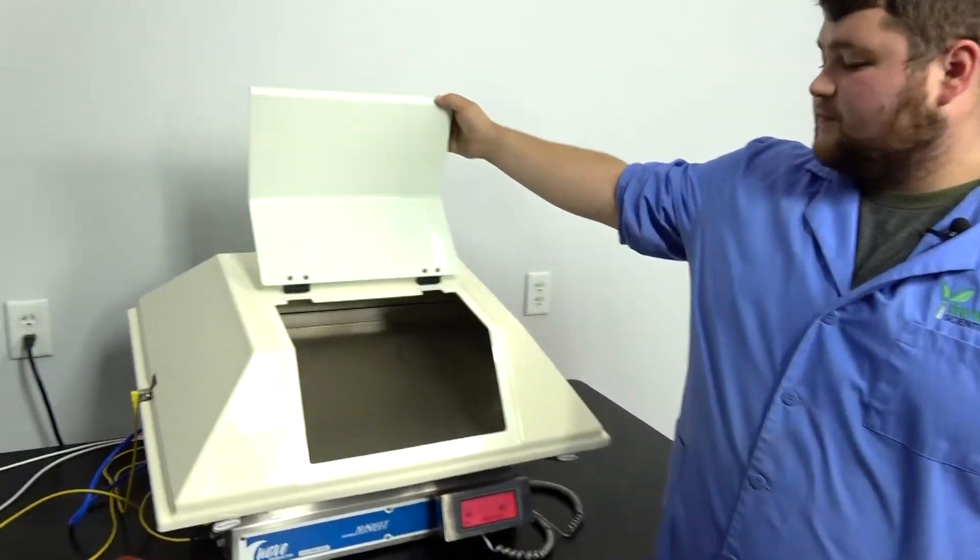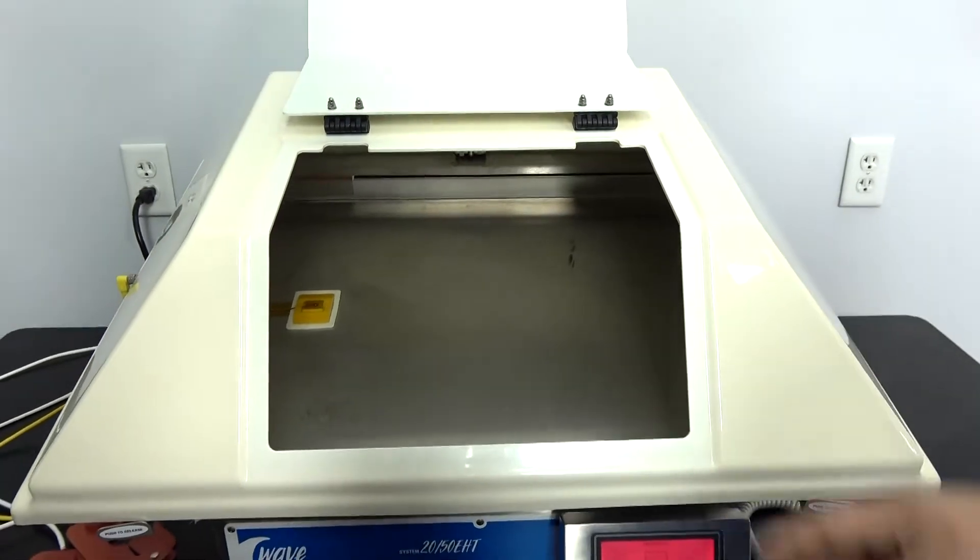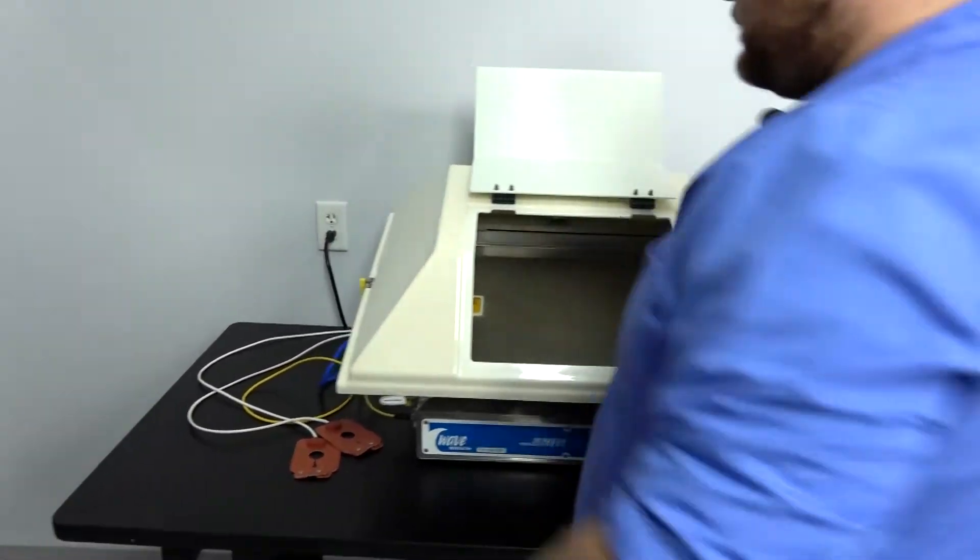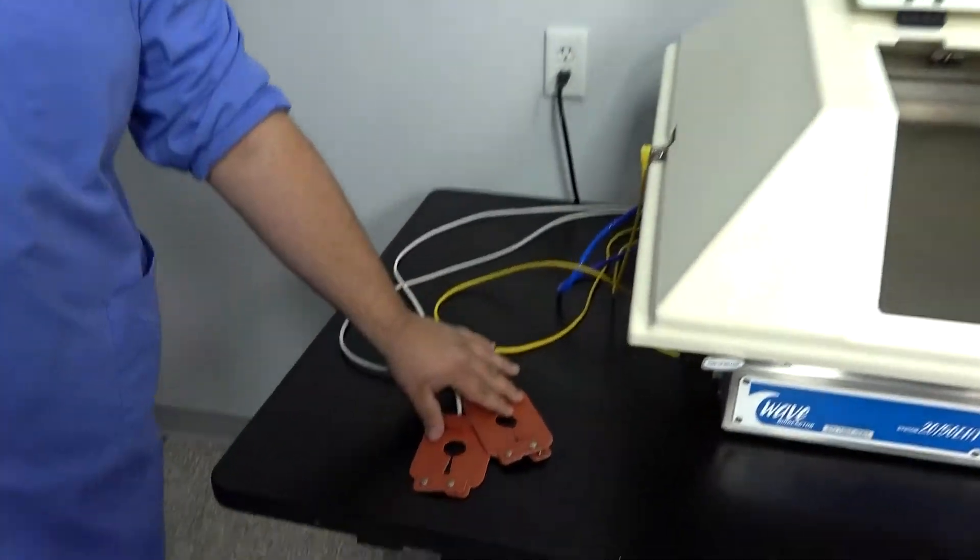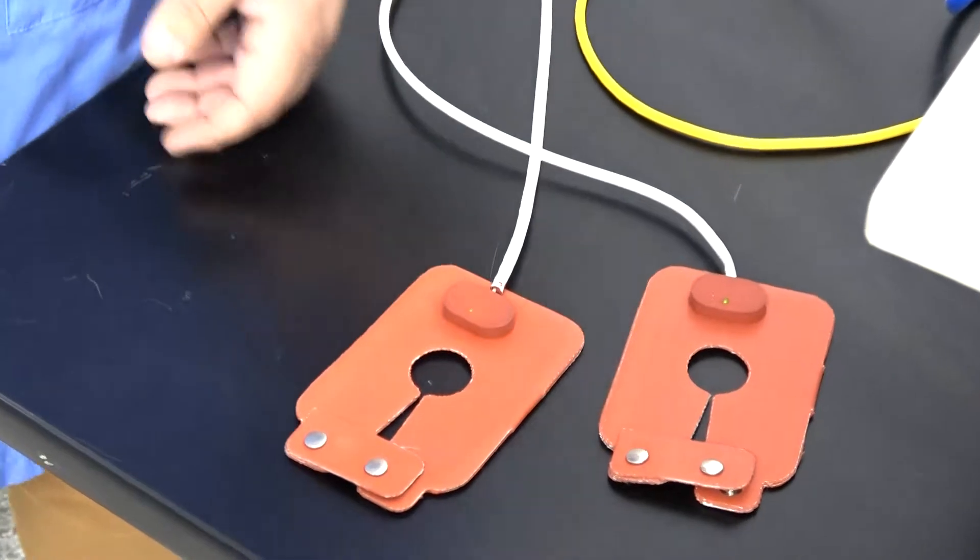You see under this lid, inside your basic table is heated, and this does come with the filter heaters over here. It comes with two heaters. You can see they're warming up right there.